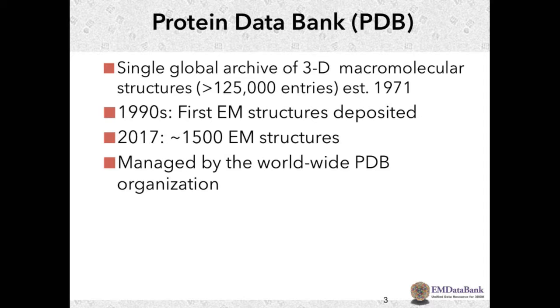Now this organization, it's a very mature archive. It's managed by the Worldwide PDB organization, which is composed of the RCSB PDB in the United States, Protein DataBank in Europe, which is at the European Bioinformatics Institute in the UK, and Protein DataBank Japan in Osaka. And actually also the BMRB, the BioMagResBank in Wisconsin.